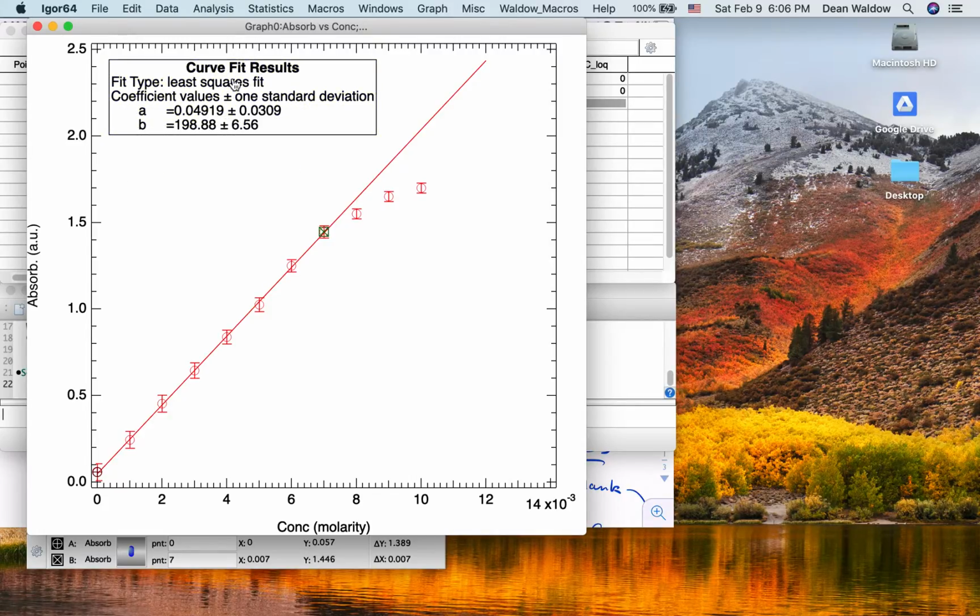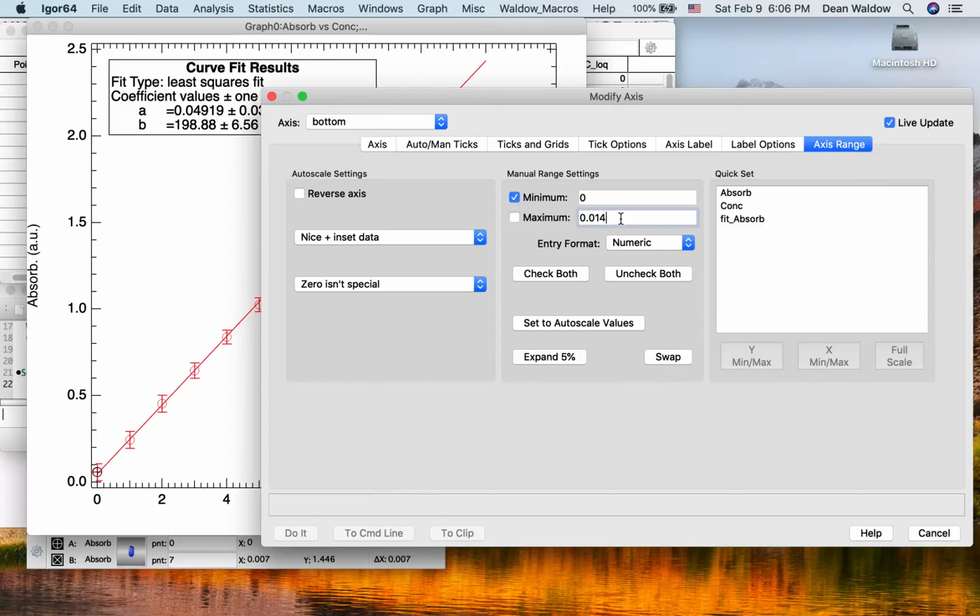So at this point it looks like we have a calibration curve, and you can see the data fits really nicely within all the error bars, and then these 3 points are veering off that fit line, and it's outside the error bars. So we're going to consider this to be not effective for the calibration. I'm also going to only go up to about, maybe 12.